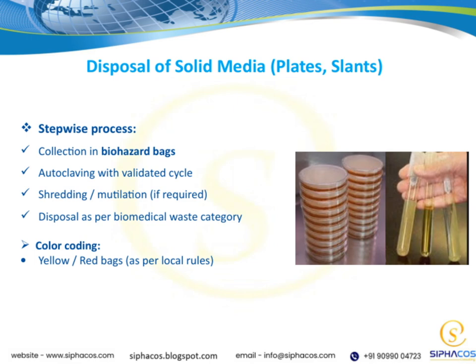It's important to remember that color coding helps us identify the correct disposal method, yellow or red bags, depending on local rules, so always be mindful of these color codes. Overall, proper disposal not only keeps us safe, but also supports responsible waste management in our lab.